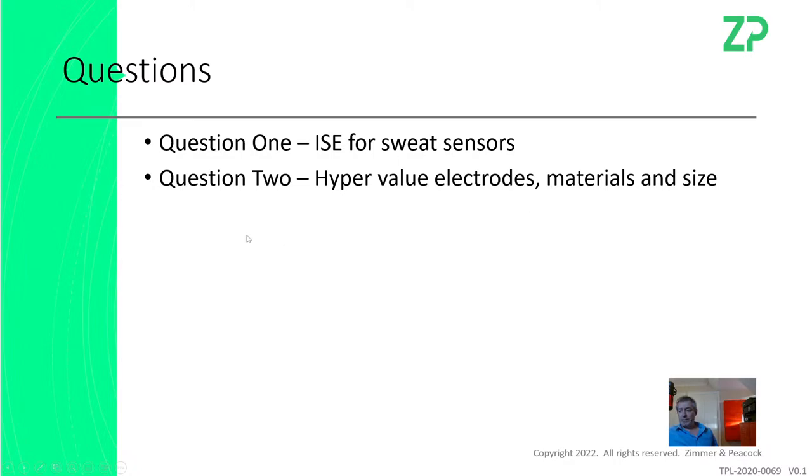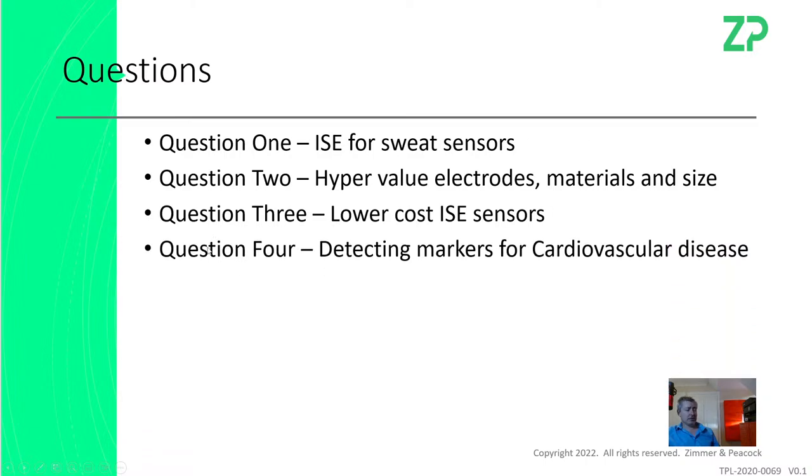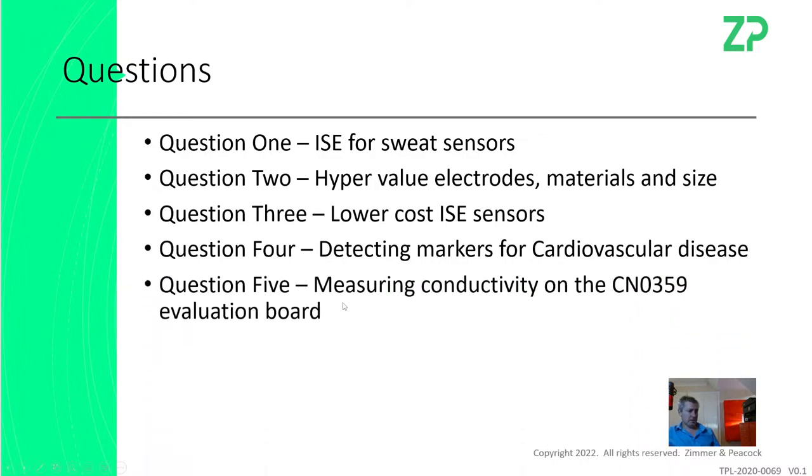Another interesting question that came in is from a user on the hypervalue electrodes, who was rightly asking about materials of construction and also talking about size of electrodes, so I will talk about that this morning. Question number three, how to make a low-cost ISE. Somebody wants to use ISEs, ion selective electrodes, in teaching, so we will touch upon that. Question number four was regarding the detection of markers for cardiovascular disease, so I will touch upon that.